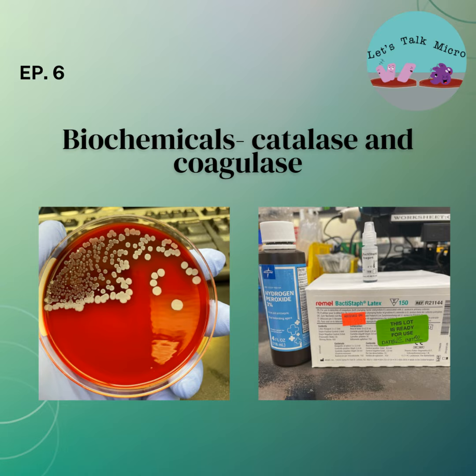Sometimes you might see wound cultures from an abdominal source, from an enteric source, that are full of Enterobacteriaceae. And at that point in time, you focus on the ones that are oxidase positive, that are more resistant in nature to antibiotics. You work up any beta strep, any Staph aureus. So always keep in mind the source.